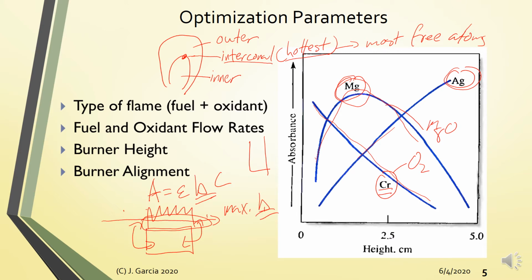But if we tilt it, I apologize for the drawing, you are able to reduce the portion of the flame where the radiation interacts.